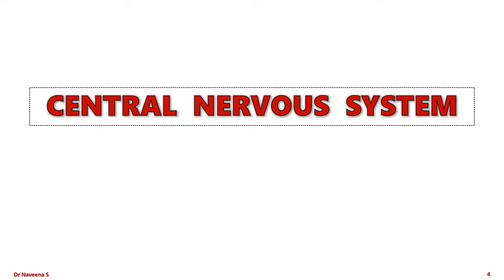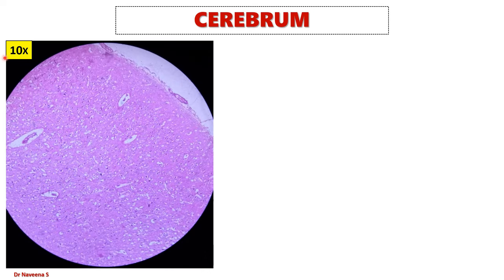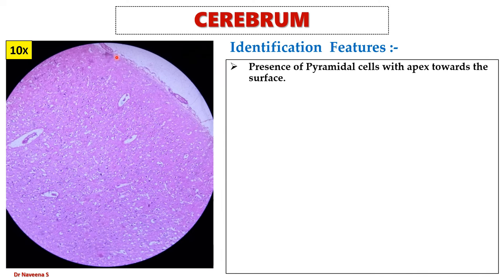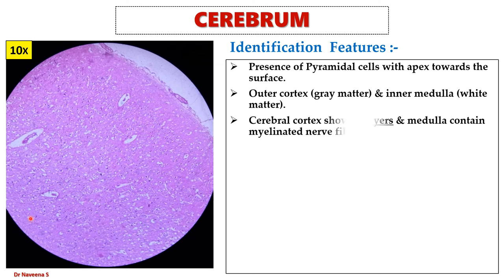Let's begin with the central nervous system slides. Here is the cerebrum slide seen under low magnification. It is identified by the presence of pyramidal cells with their apex towards the surface, and the surface is covered by meninges. Cerebrum shows outer cortex or grey matter and inner medulla or white matter. Cells within the cerebral cortex are arranged in six layers, and the medulla contains myelinated nerve fibers.